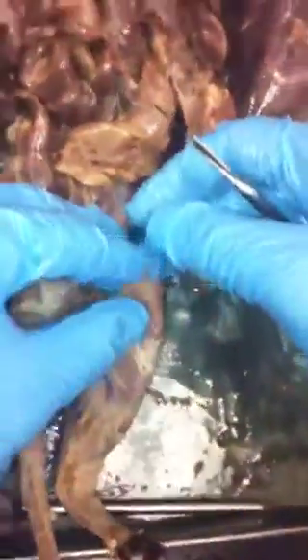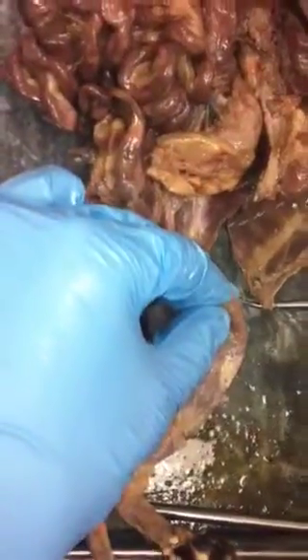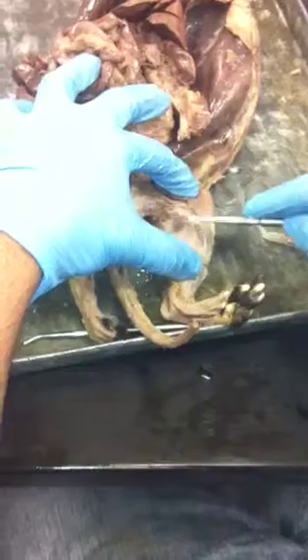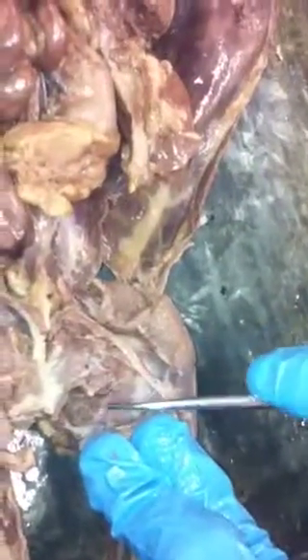This is sartorius. And then what about the... Sartorius cut. So this is superficial, and they cut these two off here, and that's the next layer. So this is what it looks like superficial. And then this is a deeper view. This is hard to tell, the adductor and everything. Adductor longus and femoris. I don't think you can even see that right here. It's because they haven't dissected it. Don't be cutting it. Blunt probe. Touch. Oh, I see it right here. These two? Longus and femoris.